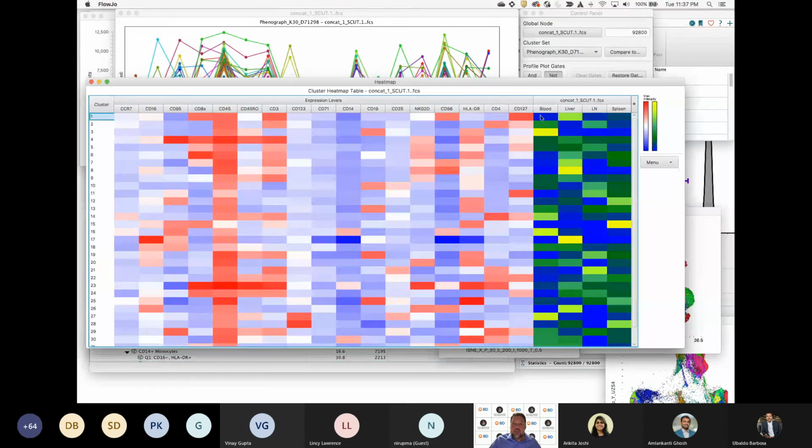And so when I select those, each of these values underlying this heat map across the blue to yellow, blue being low, yellow being high, and green being intermediate. This is a scale of 0 to 100 here, so it's just frequency. A mouse over the cell will give you the information within that column, the number of events and the frequency.